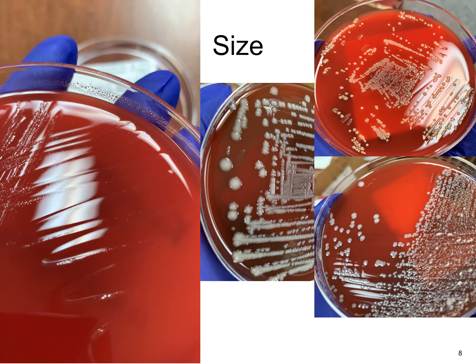With size, you are looking to see if it's a large colony, medium, small, or pinpoint. Here at the top we have some that are considered small, just in relation to the size of the colony on the plate.